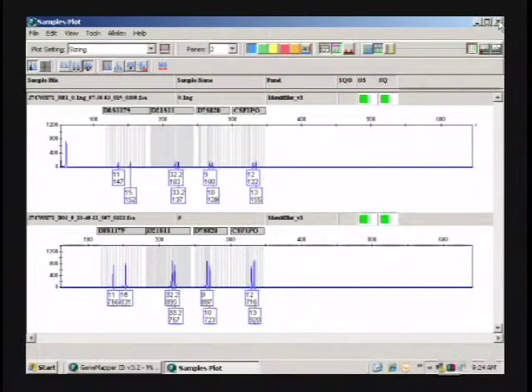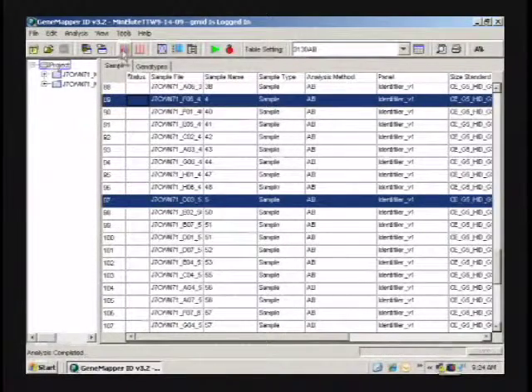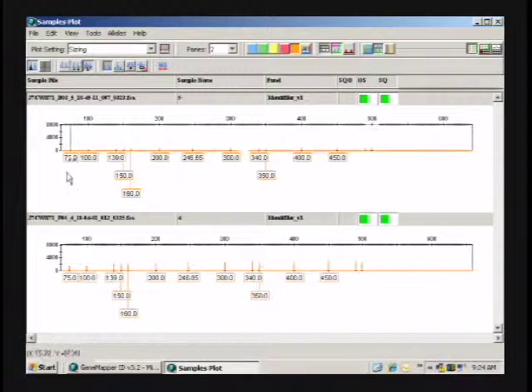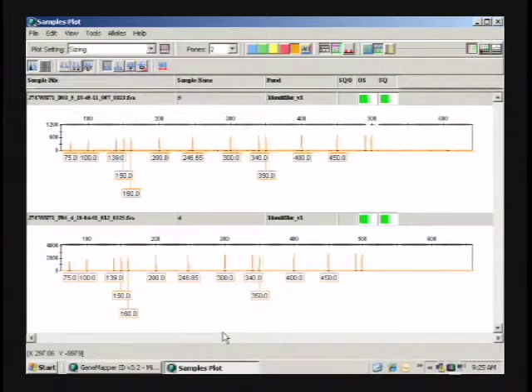What I want to do is look at something since we've noticed stuff with Liz. Let's look at Liz between 1 wash and 2 washes and see if it affects the Liz in any way. Because 4 and 5, we added all. You hadn't told me to add less, right? So 4s with 2 washes and 5s with 1 wash.